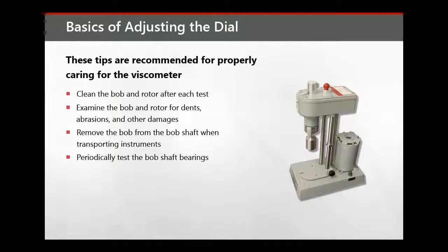Periodically test the bob shaft bearings. This is done by operating the instrument at 3 RPM or 6 RPM without a sample and observing movement of the dial. It should not move more than plus or minus one division. Rough bob shaft bearings should be replaced.